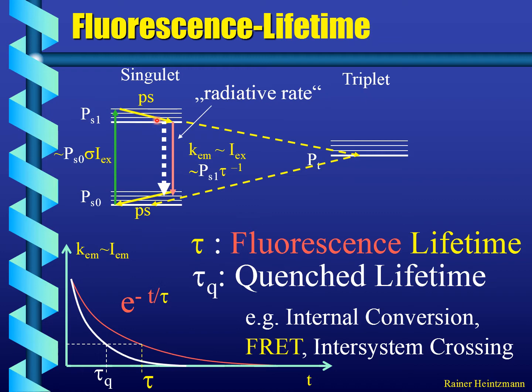That means there's some internal conversion that allows the electrons to lose their energy via other channels, vibrational channels, basically a transition via conical intersection or something like this, into a highly excited vibrational state of the S0 state. And this way, the electron can get rid of its energy as well, or the molecule if you want.